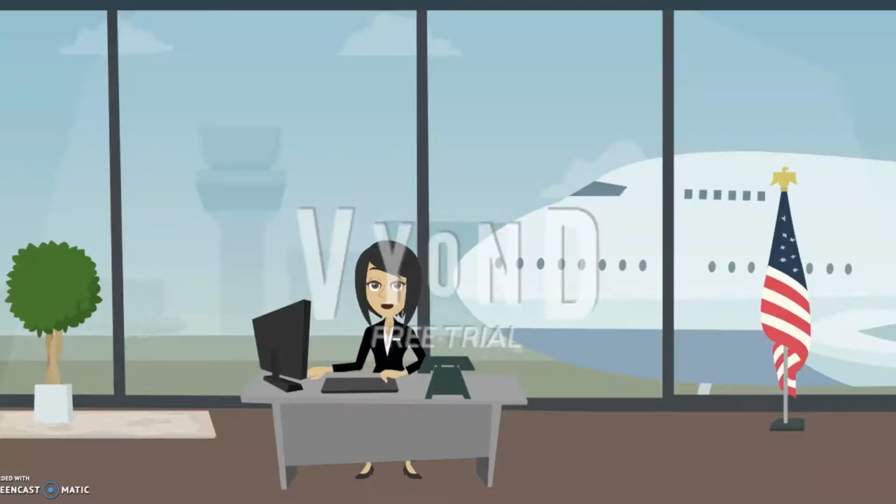This summer, I had the opportunity to work at Pratt & Whitney's Materials Control Laboratory and assisted in sample acceptance testing. One of the major issues that arises in the lab has to do with human error. When one metallurgist analyzes a sample, the sample is declared passing or failing based on his or her decision. He or she is then responsible for that specific sample and decision, so in the future no one else can inspect the sample and come to a different conclusion. This causes disagreements and uncertainty.